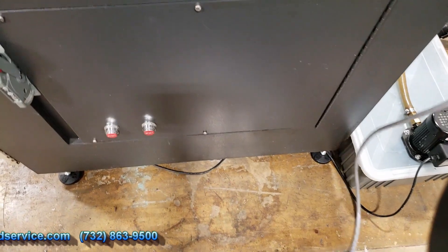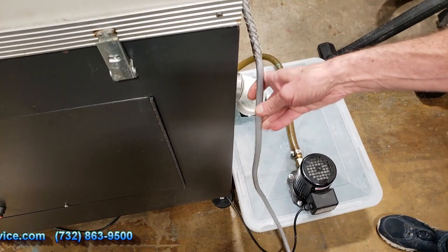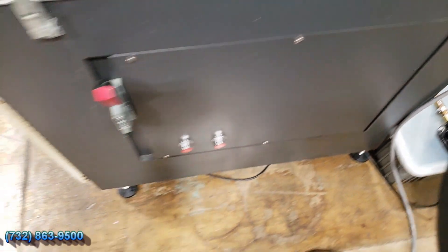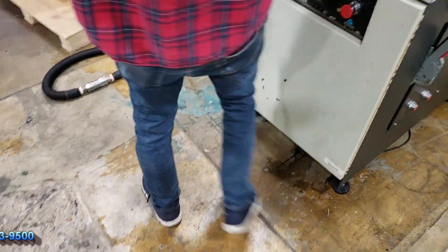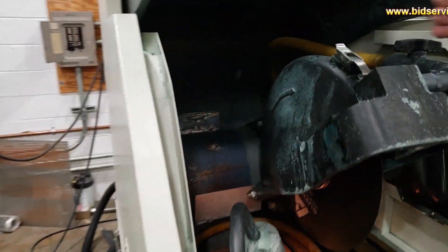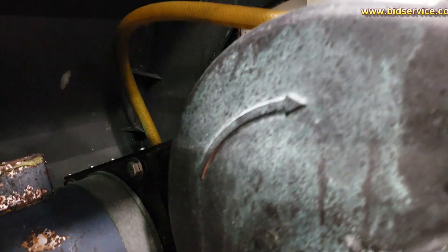Back here we also have a power cord coming in. This is a three-phase system — you want to make sure that the blade is turning the correct direction, and if it's not, you'll have to change the phase. There's a little line showing that the blade turns in this direction, towards the front.